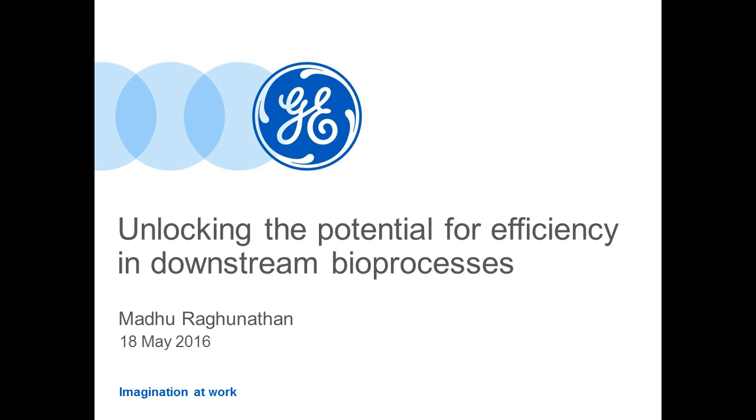And therefore, it's really important that you have the right type of process analytical tools, and the expectations when it comes to process analytical technology are higher. The reason for that is both from a contamination perspective, but also when you're running a continuous process over an extended period of time, you want to make sure that nothing untoward happens, or if it happens, you can pick it up right away.